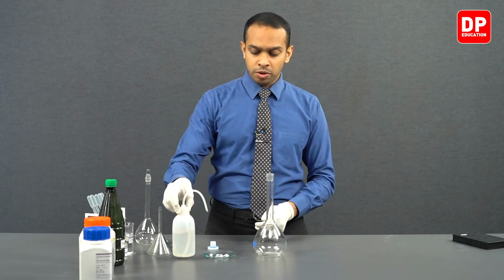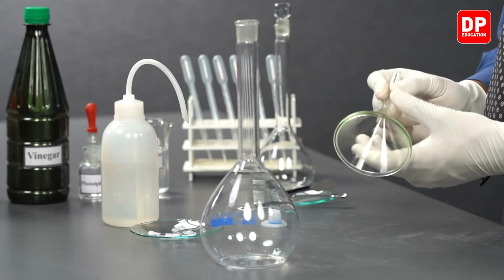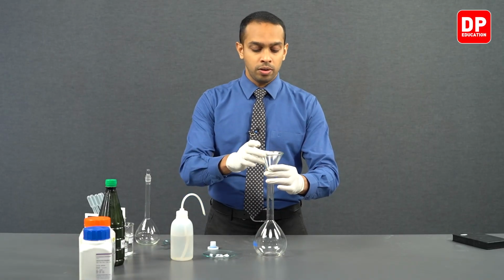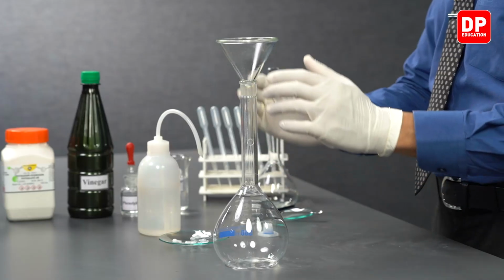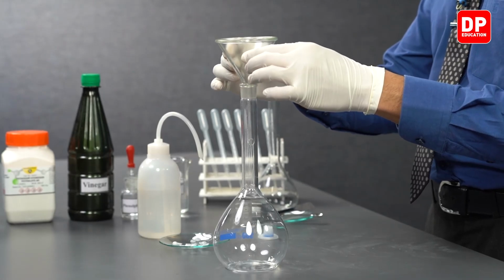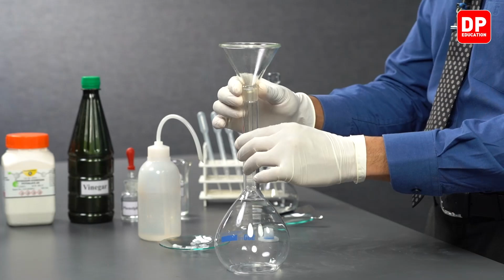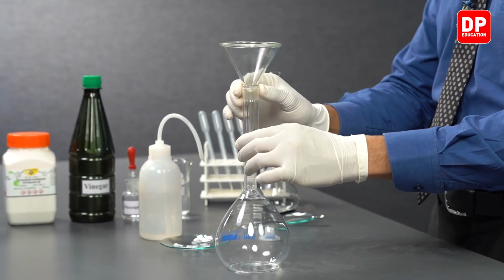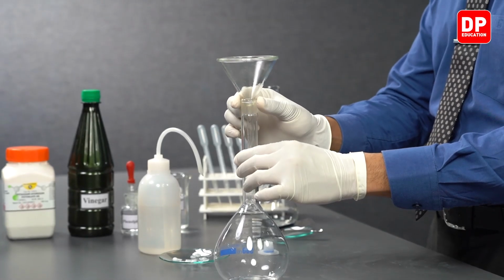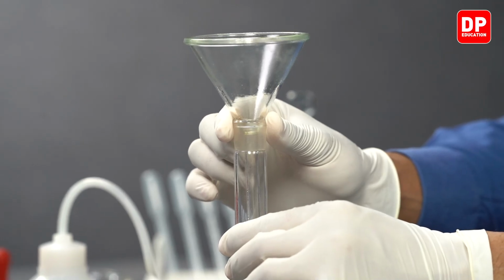For this, we will be using a wash bottle as well. We will first place a funnel on top of our volumetric flask. When you place the funnel on the volumetric flask, you do not want the funnel to sit right on the lip of the volumetric flask, creating a flush seal.